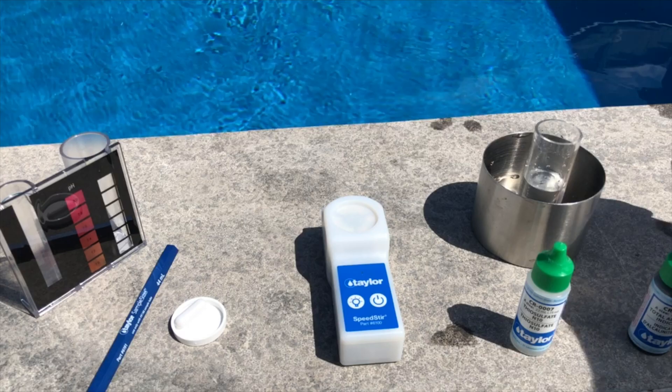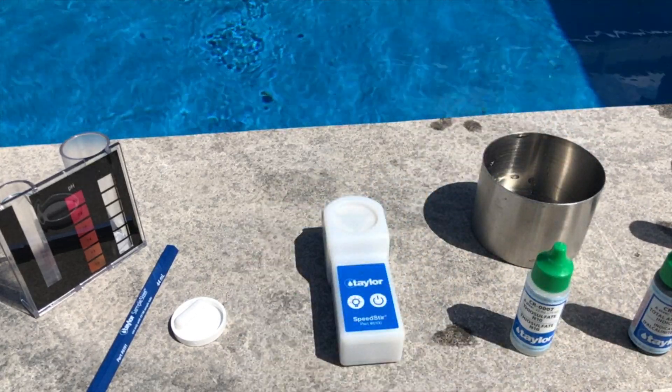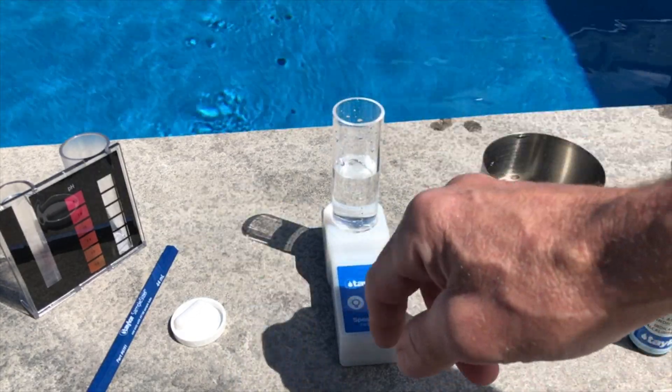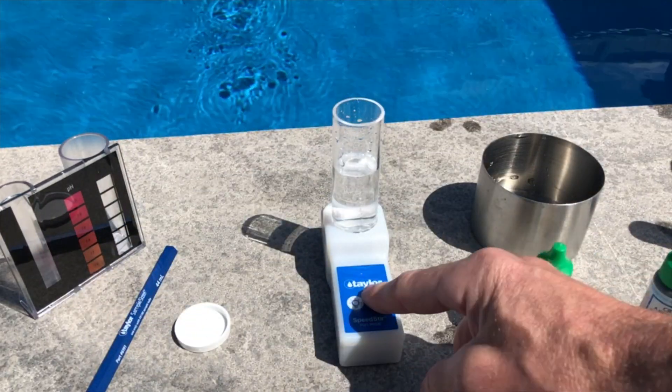Now we can take the 25 milliliter sample that we have here and place it on the Taylor speed stir, which will do all the stirring for us. We'll insert the magnetic pill and turn that on.